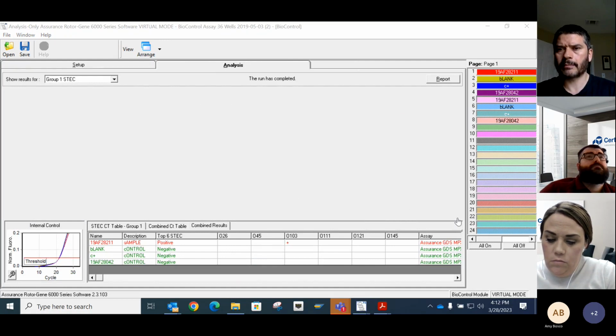That was all of the different types of runs I have. Really, it goes back to understanding that there's really 2 lines that everyone needs to know that are valid positives. Pretty much anything outside of that needs to be questioned. And most likely the invalid positive is going to be that line that basically grows at a slant.